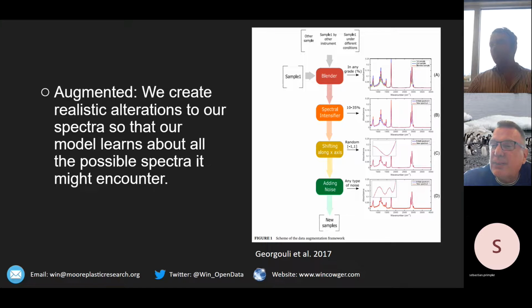The Anodisc spectra are of better quality, because you can do transmission on those. That's the reason. They have the drawback that they are cut off earlier than the ones on silver. They have pros and cons. But that's why we decided to go for another option. We can use transmission, and we can use them for everything else. We can even do Raman on them.